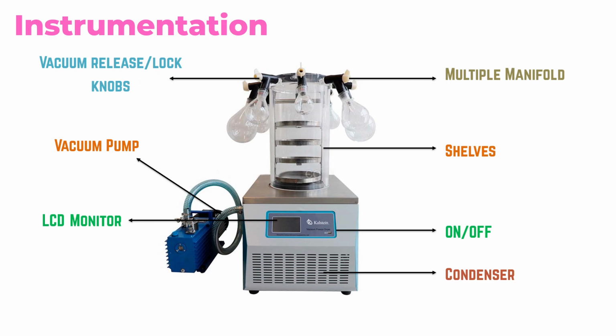This gives the desired results from the lyophilization process. So this is the process and the standard operating procedures regarding lyophilization and the lyophilizer, and I have given the information regarding the principle, the basic instrumentation, and the standard operating procedures.